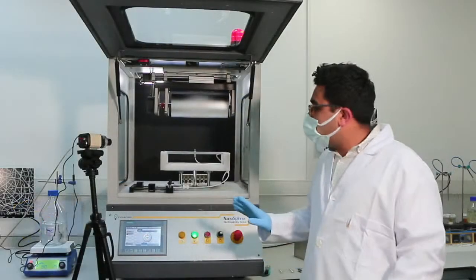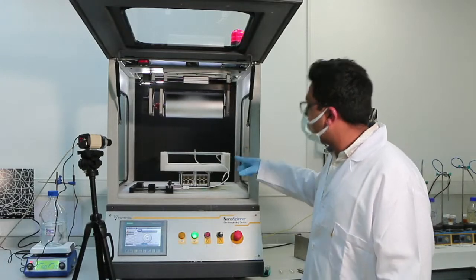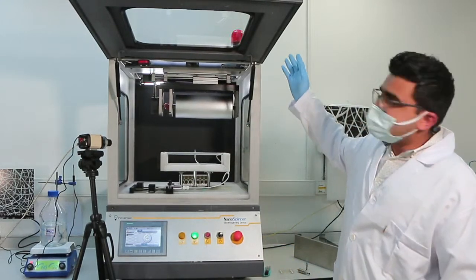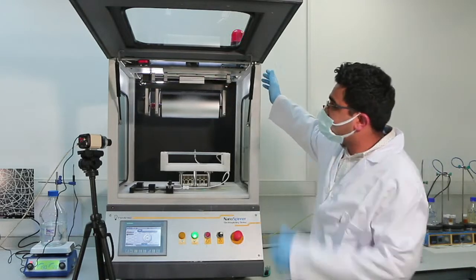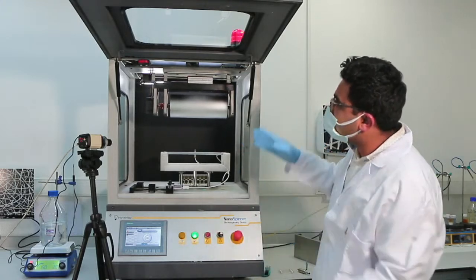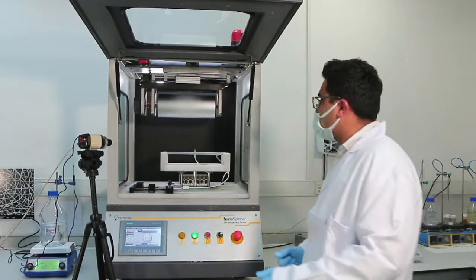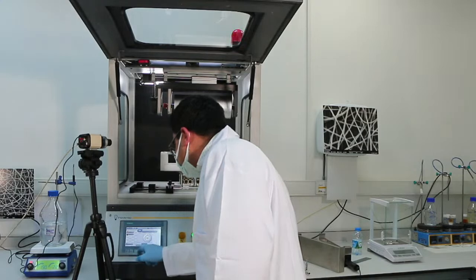Another thing is that when you're electrospinning, the solvent is being vaporized, evaporated into the chamber. For such a thing, you need a ventilation device. Luckily, our machine has an exhaust fan at the top. What it does is exhaust all of the solvent in the chamber outside into your ventilation shaft, to prevent the solvent from accumulating. Let's see if we can play around a little more, like what else we can do with this.